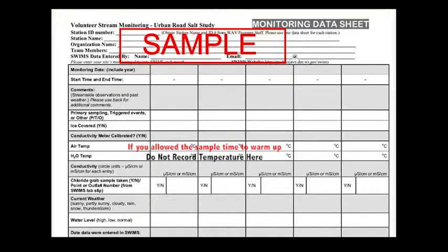before leaving the field site, measure the stream water temperature using the handheld thermometer provided in your kit. Please record the temperature of the water at the time the specific conductance reading was taken, as read using the ECTestr, in the comments section of your datasheet.